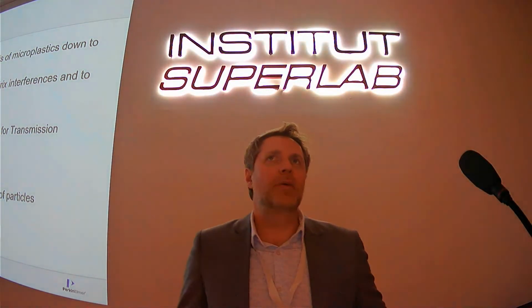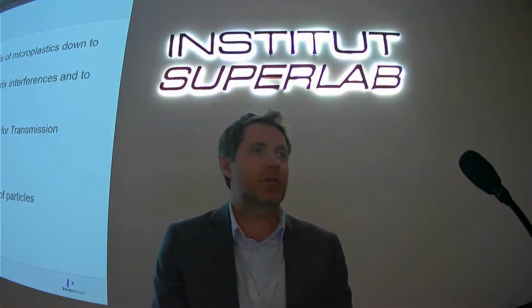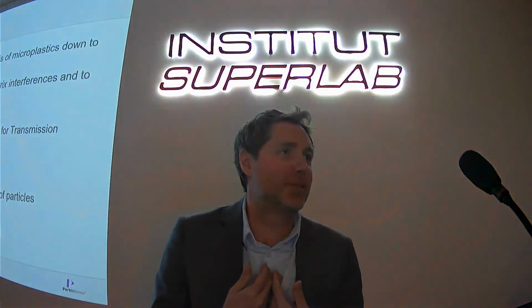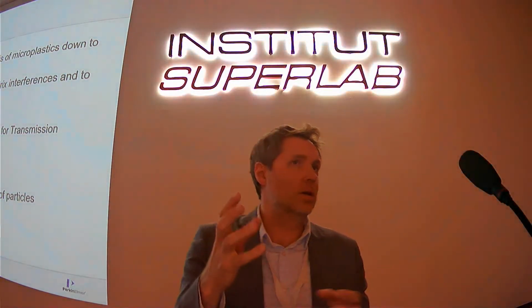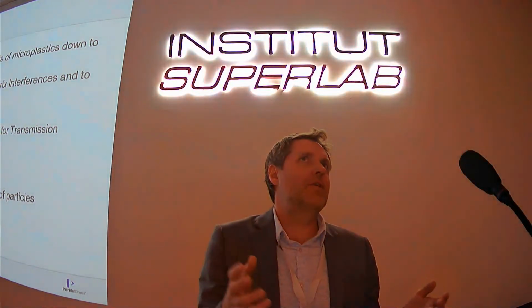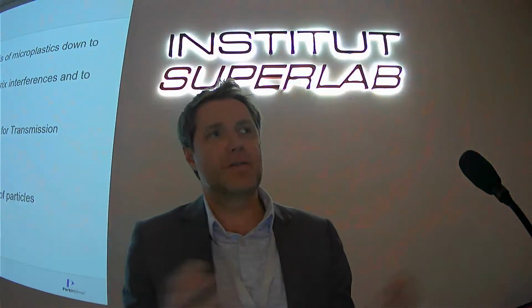Obviously I'm going to be biased, so I'm not a good independent regulator. But I can tell you, we do a lot of work with the National Oceanographic Centre in the UK in Southampton, and they are obviously unbiased. In my ideal world, everyone would have PerkinElmer equipment. The reality is people don't. And when they look at the results from the interlaboratory studies, generally the answers count between all of them with FTIR microscopy. I'd love to tell you that honestly, unless you buy PerkinElmer equipment, everything else is bad. But that's not true.